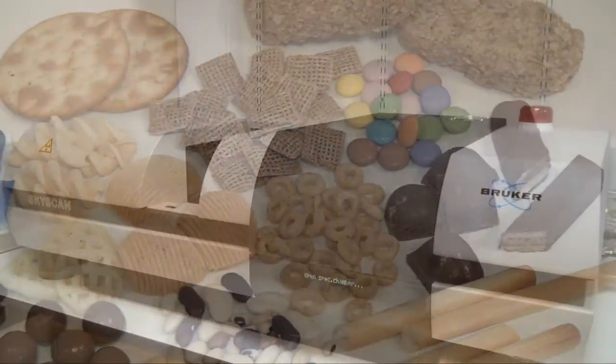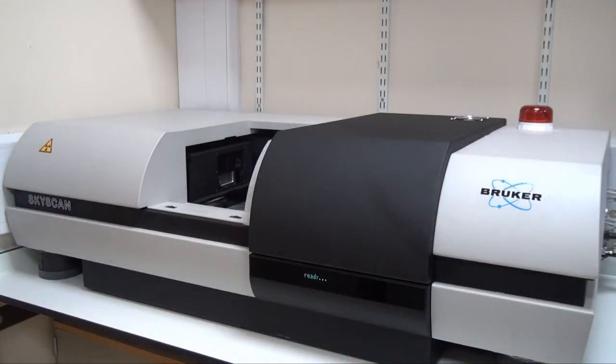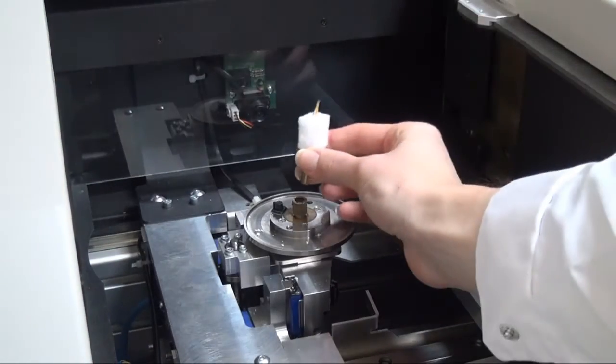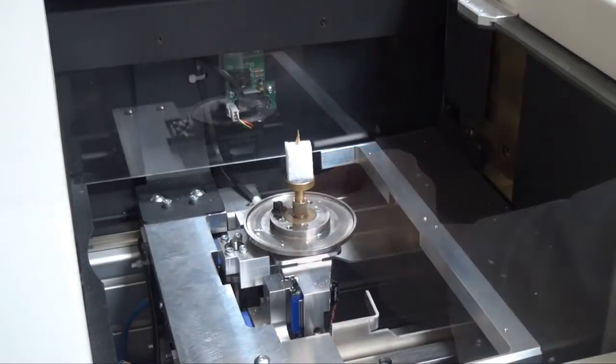The X-ray micro CT scanner can give tremendous insight into the internal structure of foods and packaging, as well as troubleshoot problems and defects, without damaging the material being studied.